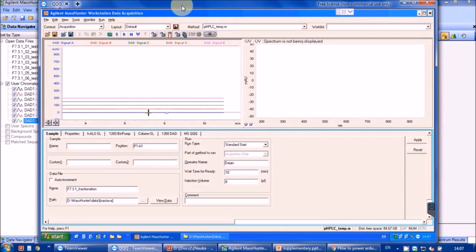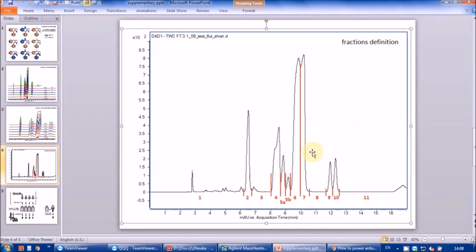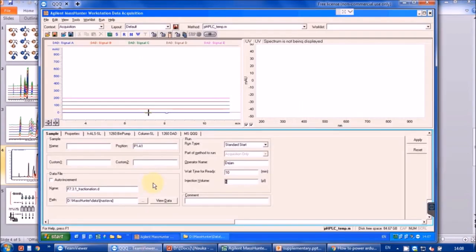Now we can finally perform the preparative separation. The 6 microliters of sample will be injected, and the operator will closely monitor the DAD signals and compare them to the previously defined collection schedule. Each fraction will be collected into a pre-labeled test tube or a flask with the needed vessel volume calculated according to the fraction duration and volume flow.